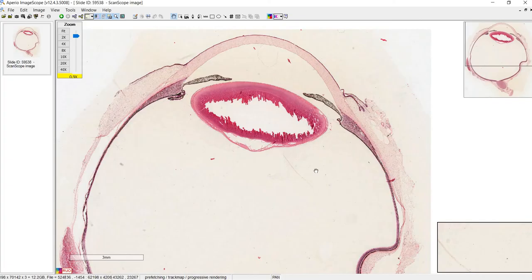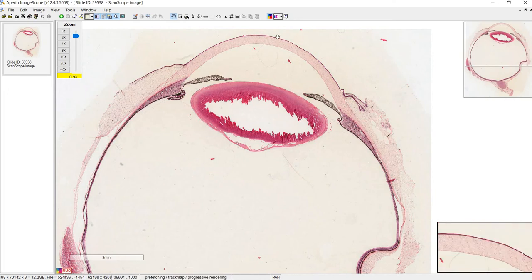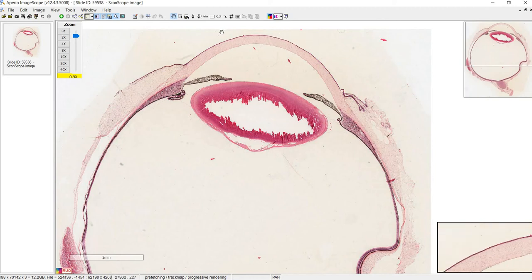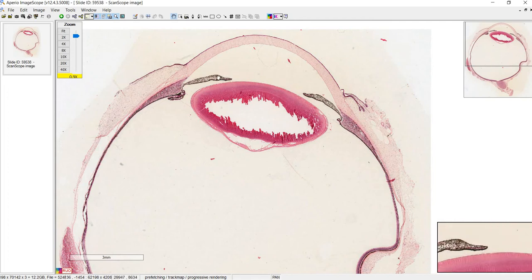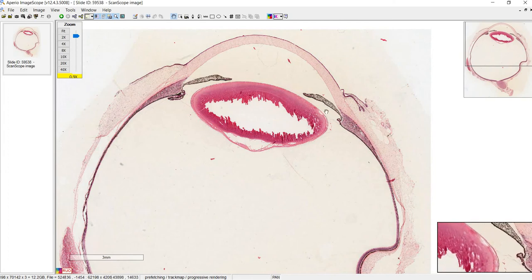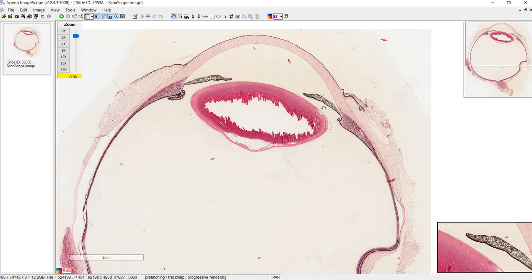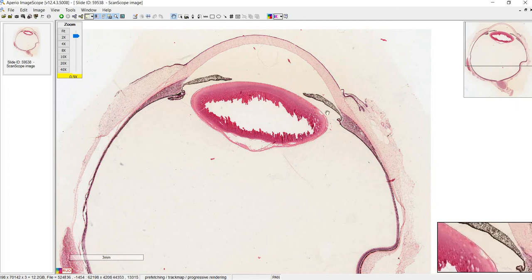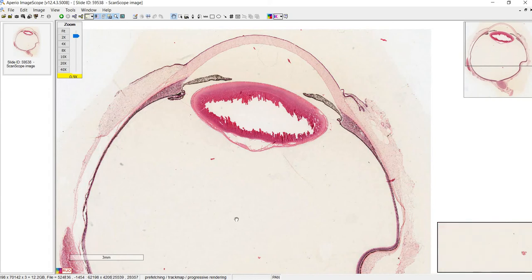So this is the monkey's eye, and a lot of the structures here are better preserved than in the other slide. We'll start from the anterior portion and work our way backwards. Up top we have the cornea, the most anterior and superficial portion of the eye that interfaces with the air. Behind that we have the anterior chamber. These two dark pieces are the iris — it's actually one circular structure, appearing as two because we only see a two-dimensional slice. Between the iris and the lens we have the posterior chamber. Both the anterior and posterior chambers have aqueous humor. Behind the lens we have the vitreous body containing vitreous humor.